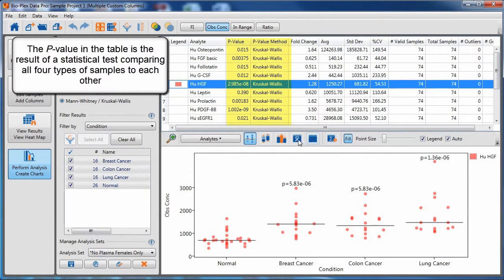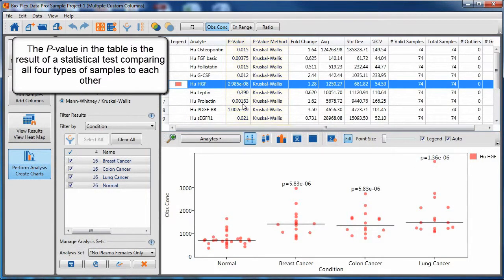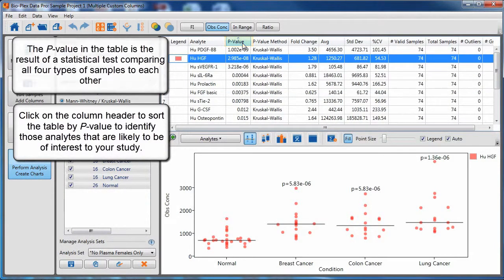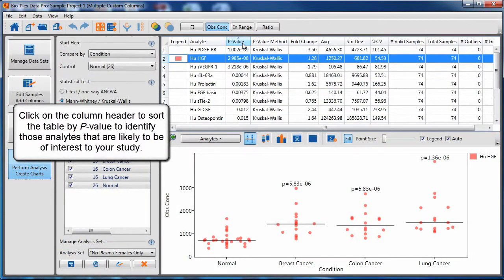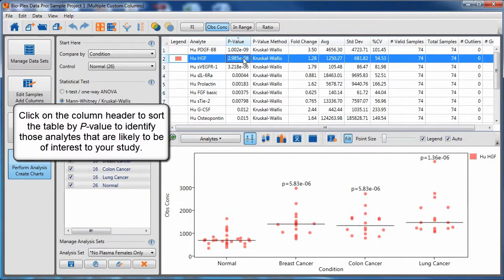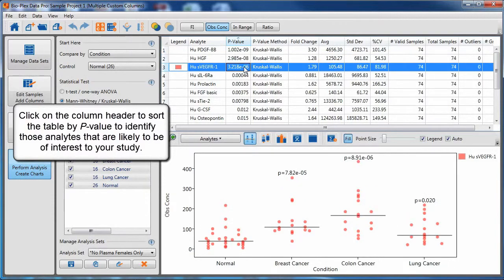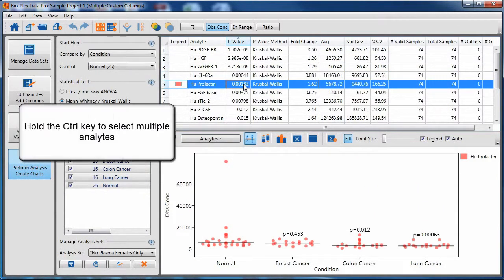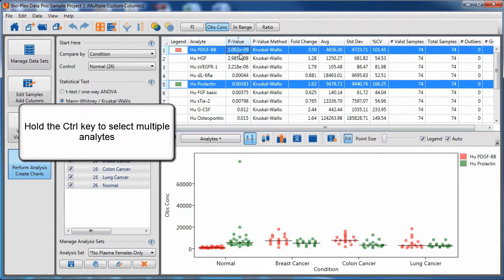The p-value in the table is the result of statistical tests comparing all four types of samples to each other. You can sort by the p-value, thereby identifying analytes that are most important for your experimental conditions. Hold the control key to select multiple analytes.